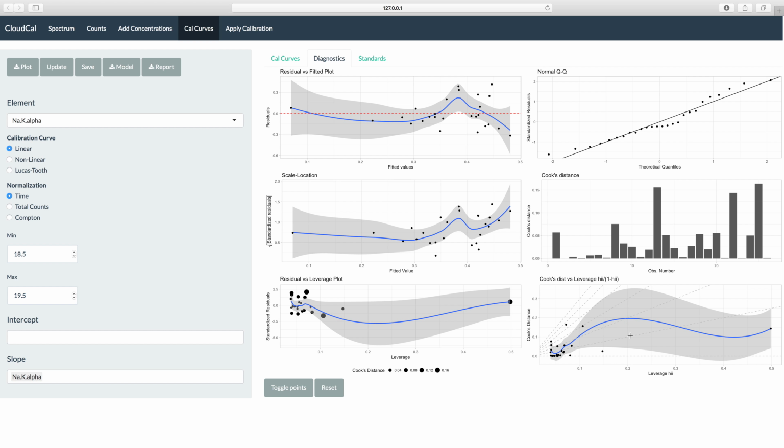And then finally, our leverage plot kind of gives a sense of outliers. Now, quick note on outliers. Statistical outlier is also discussed as just a value that hangs out further than the others. For example, some would argue this point over here would be an outlier. I would take a much more cautious approach, because an outlier strictly should be something where the known value is incorrect. In other words, an invalid value.